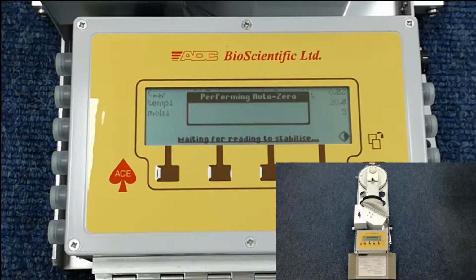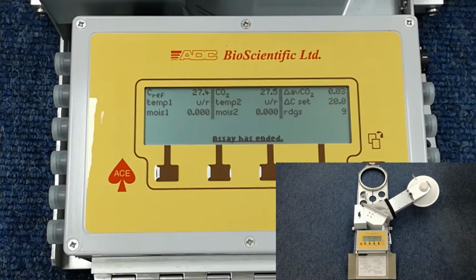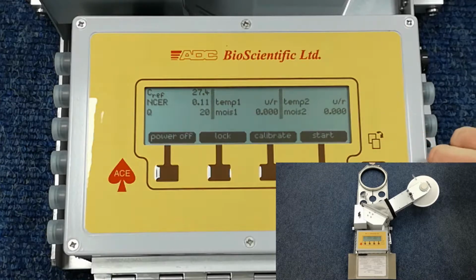Finally, a zero measurement is made after the lid or chamber has opened at the end of an assay. This value is used to recalculate ambient CO2 and so produce calibrated delta CO2 and NCER values.